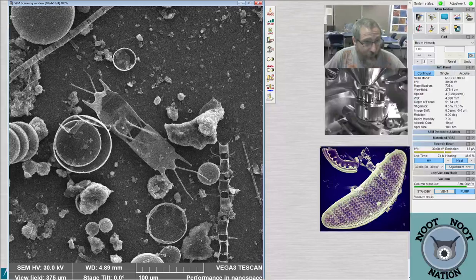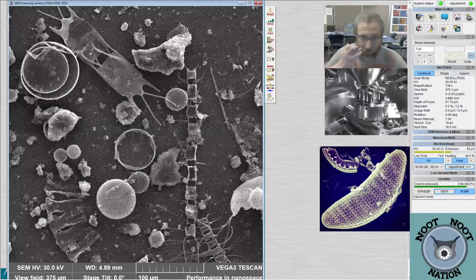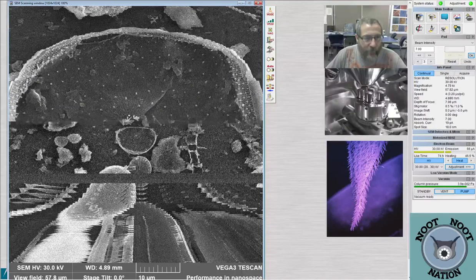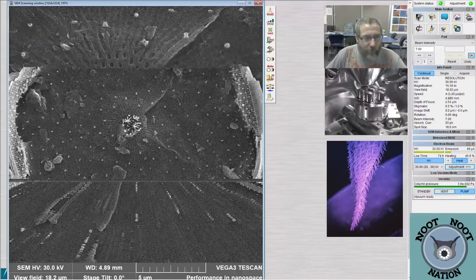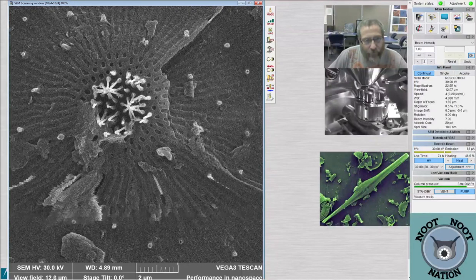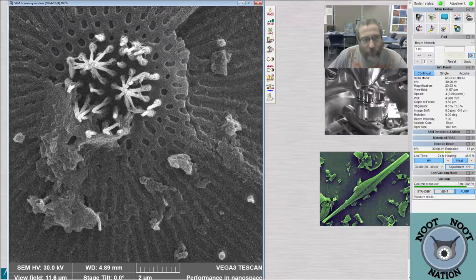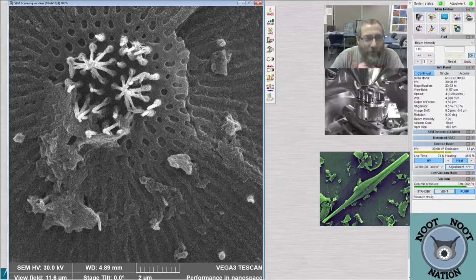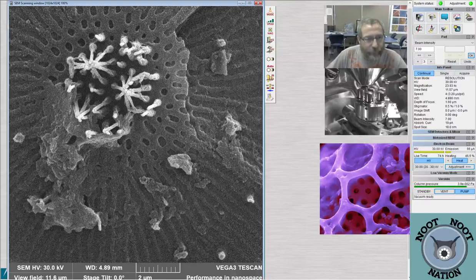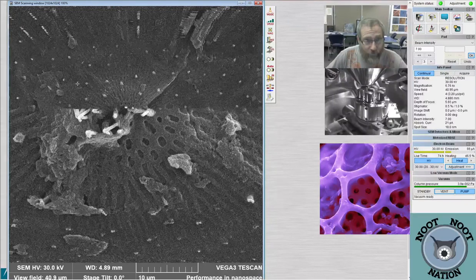But if you're thinking about the Thalassiosira that we saw that had sort of a connecting piece between them, those ones, it's a piece of chitin that's coming out of the central fultoportula. And I can give you a really nice view of one of those here, because this is Thalassiosira, I think it's weissflogii, and it's got a series of these little tubes up here, and it uses these little tubes to squeeze some goo out, and then it connects to its sibling cells that way. So all of these little tubes are processes that are used to connect them together in those little colonies.